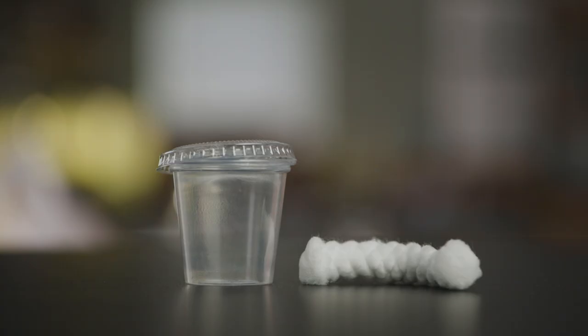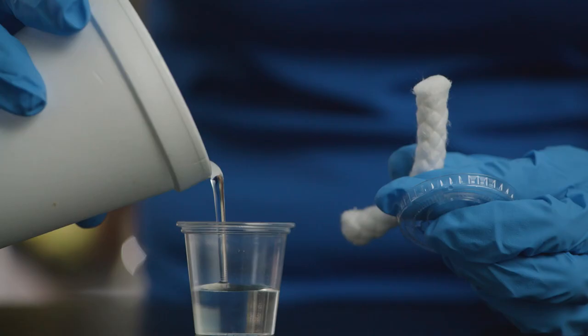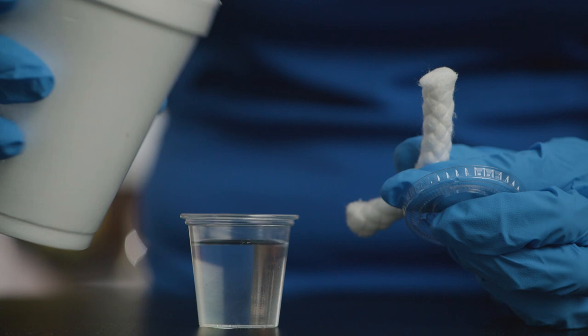Carolina's milkweed bug kits come with a water container and wick to provide water without the risk of drowning. Fill the bottom of the container with water. Pull the wick through the lid and place the lid on the container.